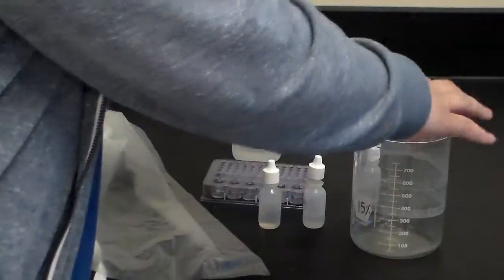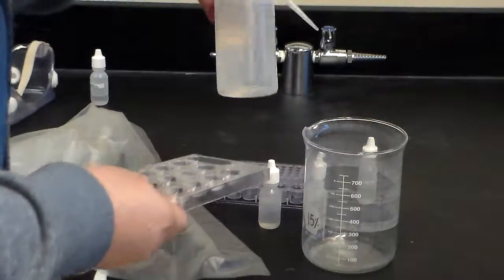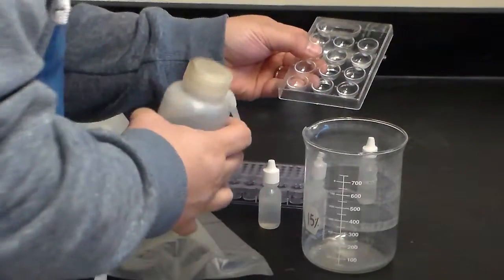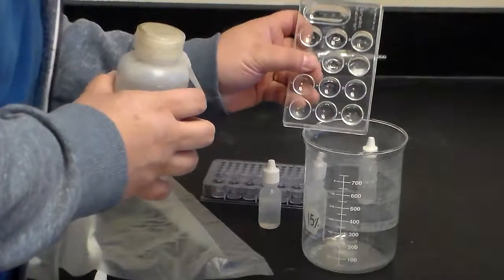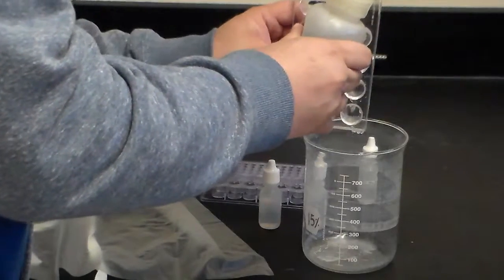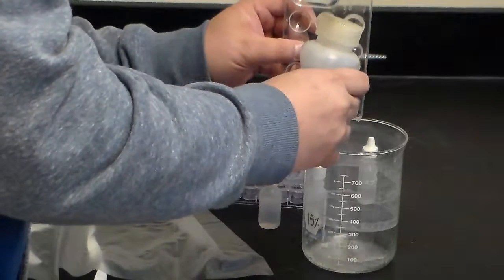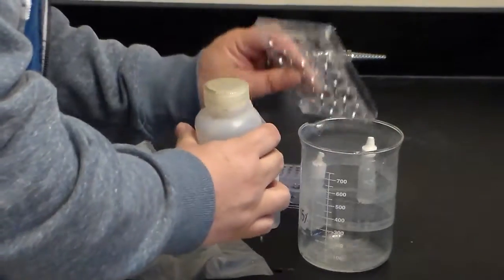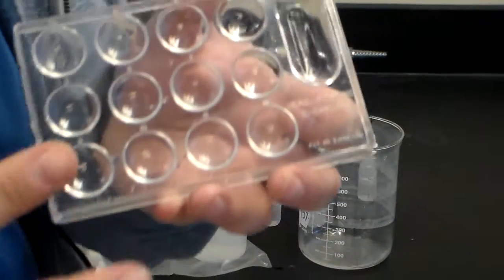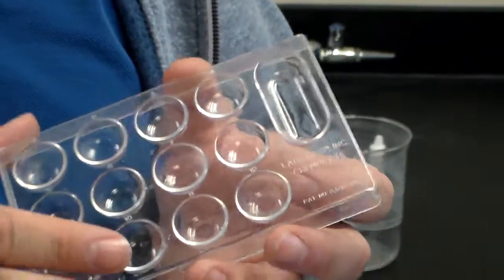Okay? Now, when you're done with that, we cannot just dump it down the drain. What you need to do, there will be a station where there will be a beaker like this, and you will see a water bottle like this. So what you're going to do, you're going to take your tray like this, and then gently squirt the bottle with the distilled water in it until it is rinsed out, and then you're going to take a paper towel and you're going to dry it up. That's a very important idea.